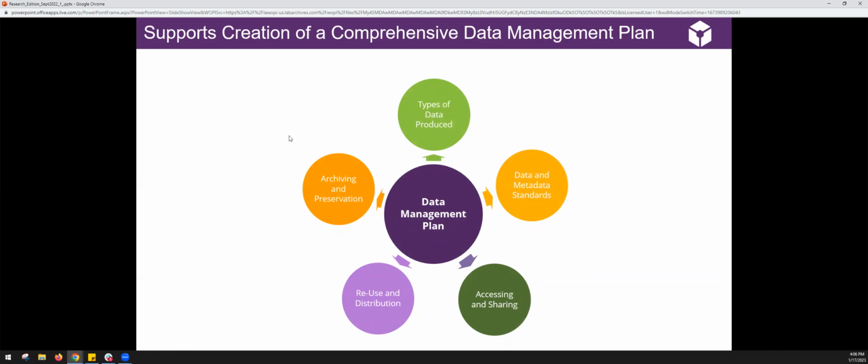But if you just have a kind of informal agreement, and that's what a lot of groups have, just sort of, hey, well, we collect data like this, and we name it this way, and we put it here, and here's who we give access to. Having that written down somewhere, might be a LabArchives notebook where it's written down, might be a DMP tool, might be other resources on campus, can be so valuable. Because when someone looks back at your work 2, 3, 5, 10 years from now, they need to be able to understand what you did, how you did it, where you did it, and so forth. Most importantly, they need to understand all of that without speaking to you. That's sometimes a hard test to pass.